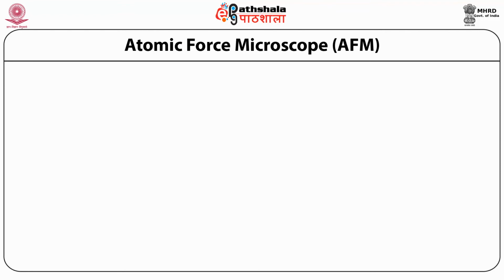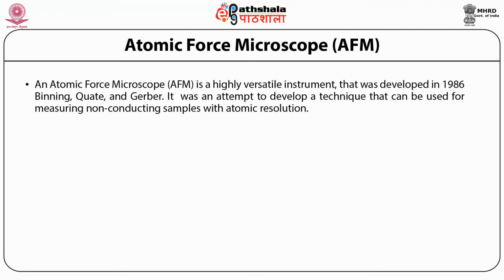Atomic force microscope, that is AFM. An atomic force microscope is a highly versatile instrument that was developed in 1986 by Binnig, Quate, and Gerber. It was an attempt to develop a technique that can be used for measuring non-conducting samples with atomic resolution.